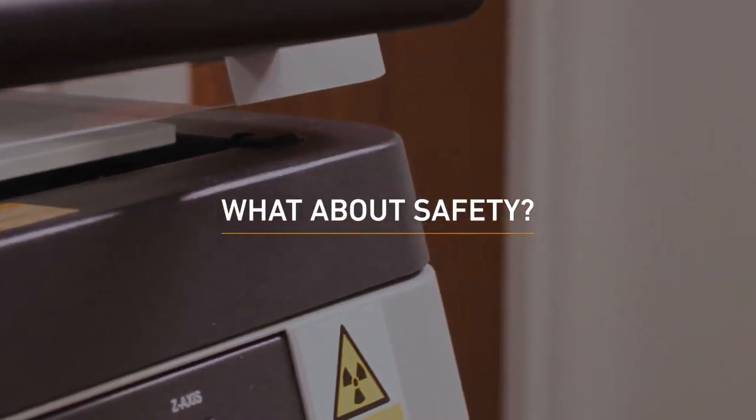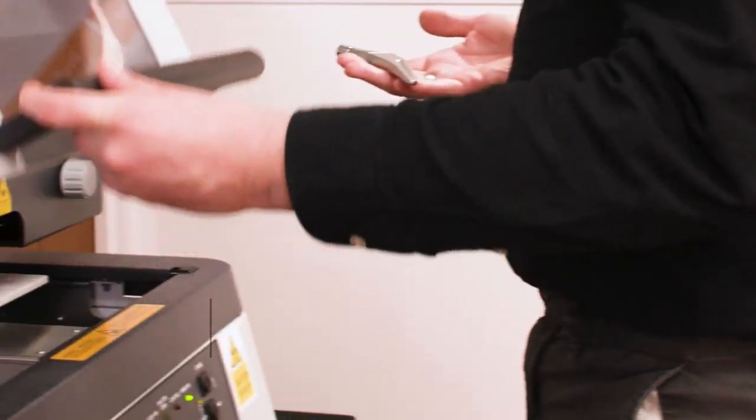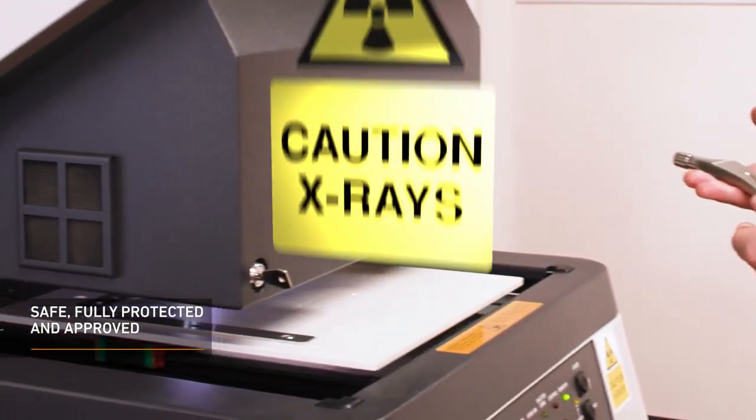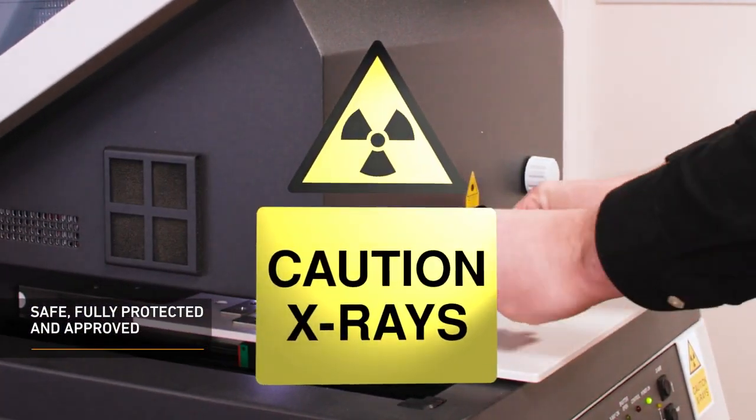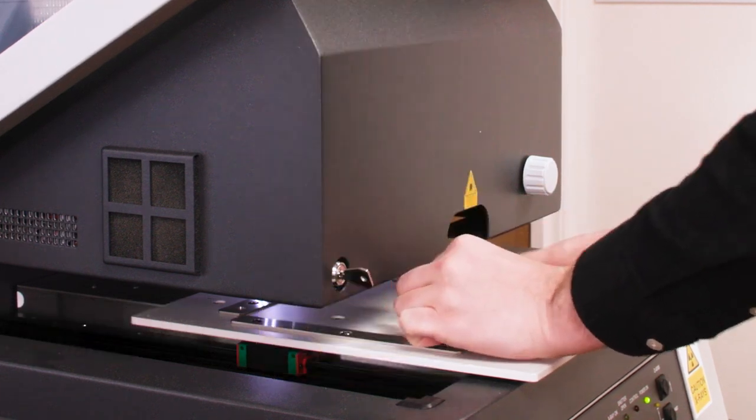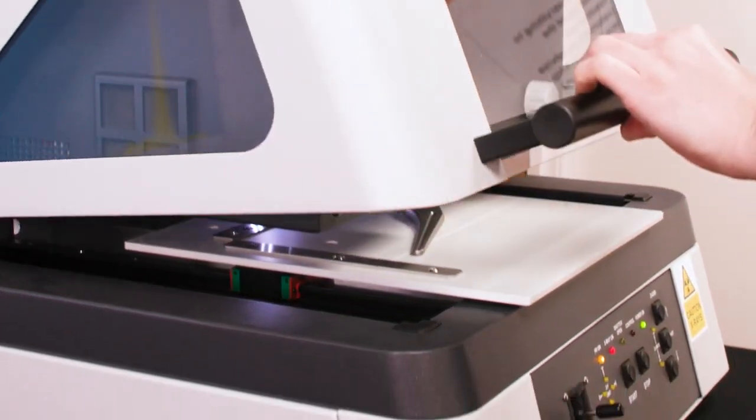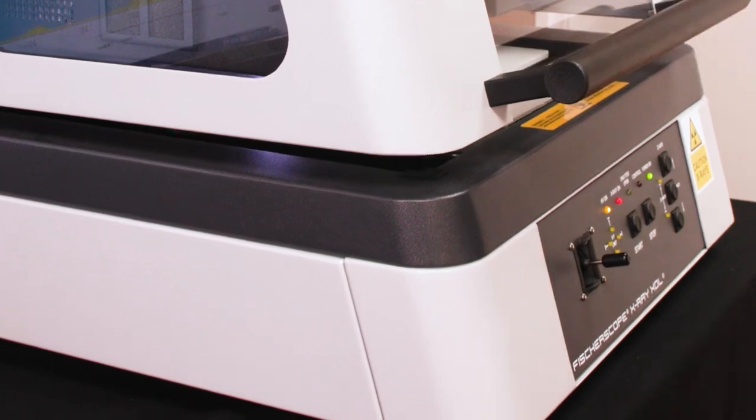What about safety? Safety is of the utmost importance to us and our customers. As such, the FischerScope X-ray XDL-240 is a fully protected instrument with type approval according to current radiation protection legislation.